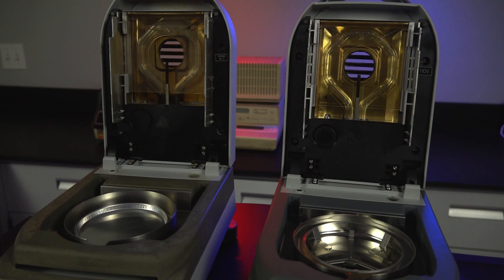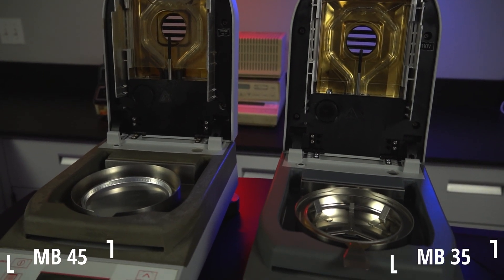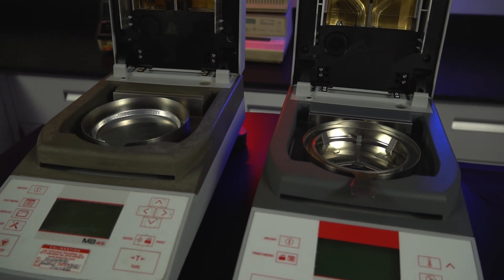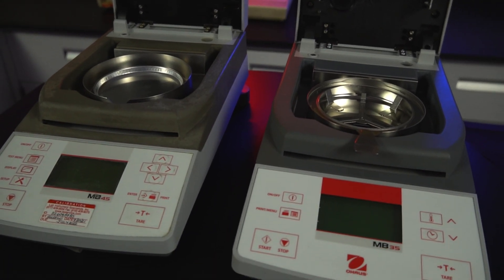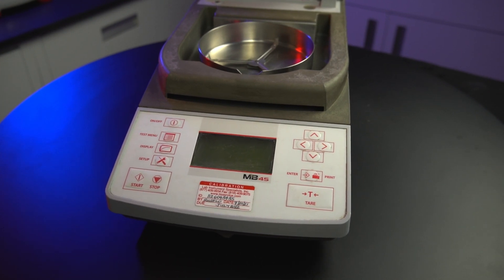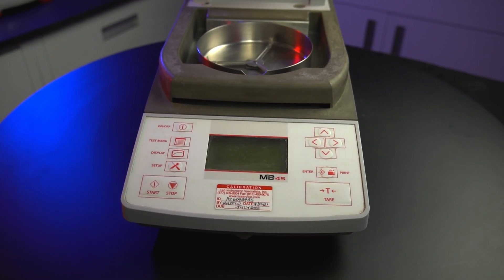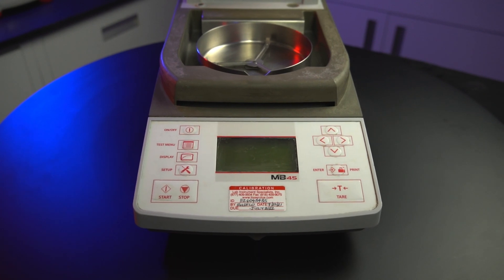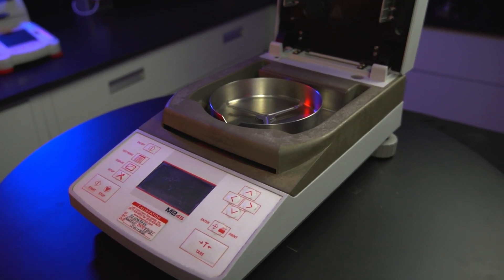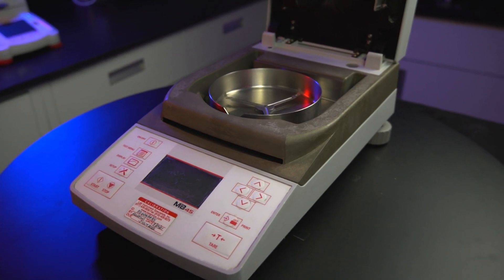Next in the series is the MB-45 and 35. Released in 2000 and 2002, these were the first of the modern-looking designs, as well as the first to use a halogen heating source, designed to be twice as fast as their infrared counterparts. This unit also included a fully programmable front panel and let you store up to 50 different sampling methods to make testing a variety of products easier.